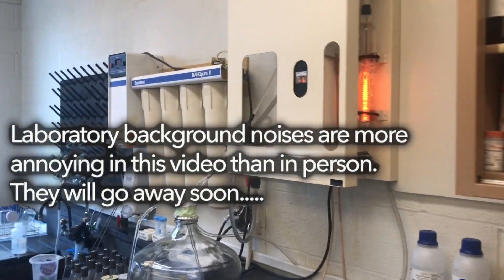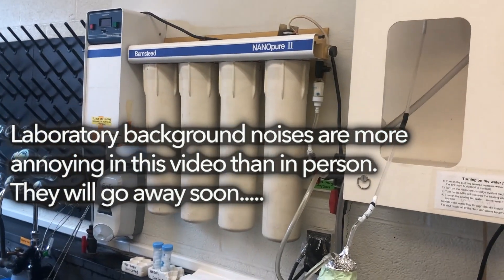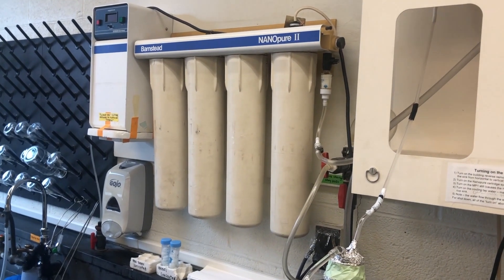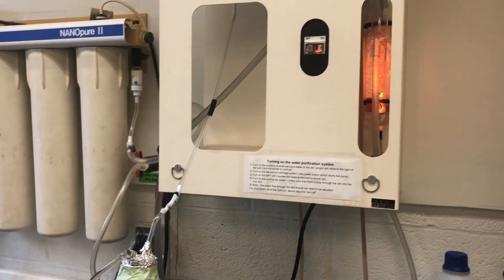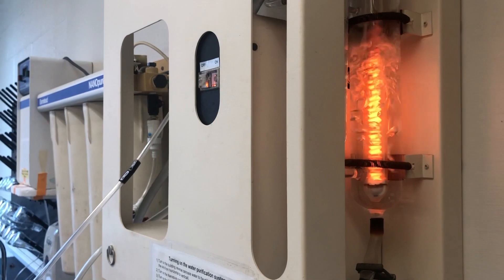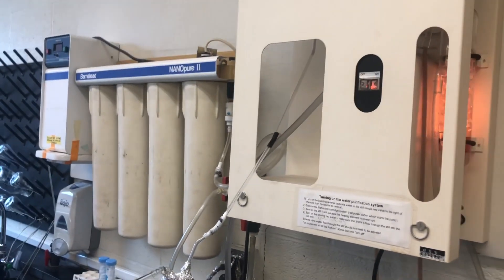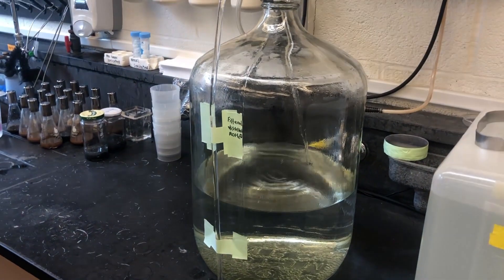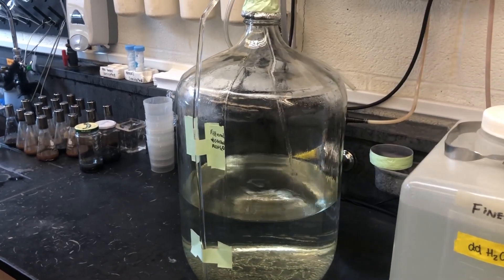This is the still in the laboratory. It takes very high quality building reverse osmosis water, puts it through this four-cartridge purification system, and then through a glass still shown right here. The water is boiled, condensed on the coils up there, and then what we get in this container drop by drop is very high quality water for media prep.